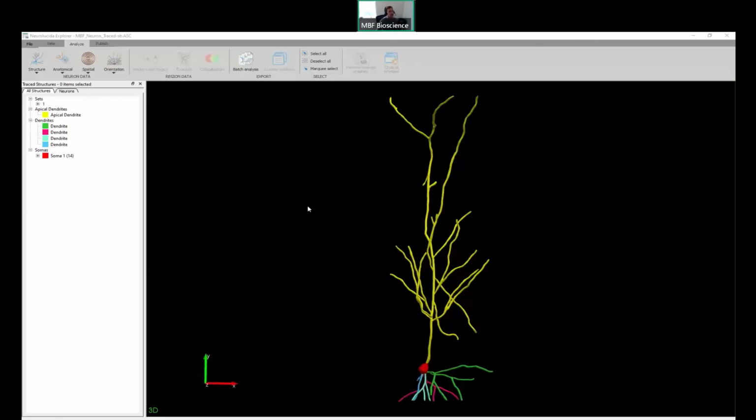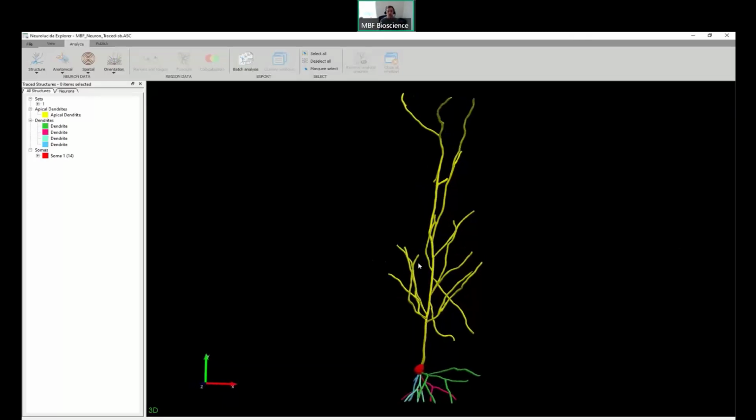So that's going to be more on Neurolucida 360. When you have those images open, let me close this and I will open up Neurolucida 360 for us. When you have those images open, the Image Organizer is probably going to be the solution. So give me one quick second while I open that up, and then we can look at that together.